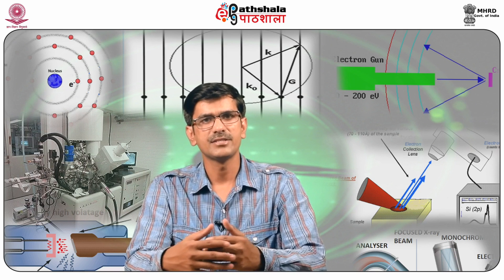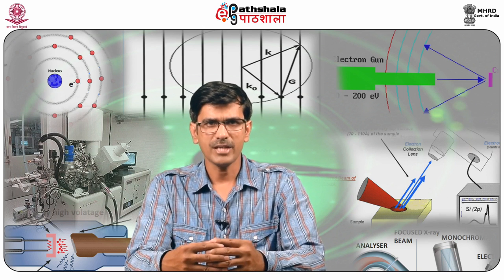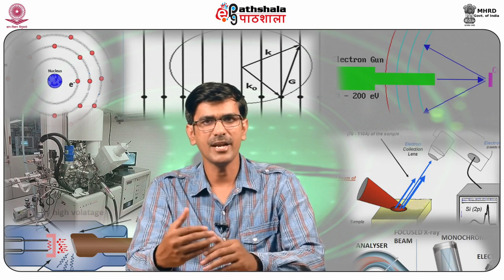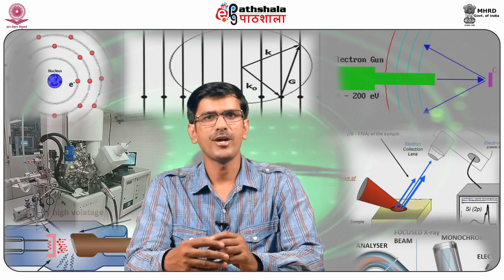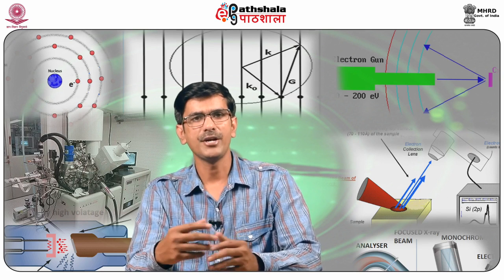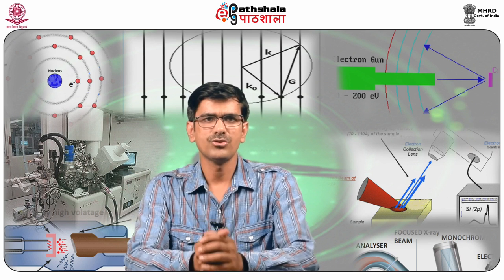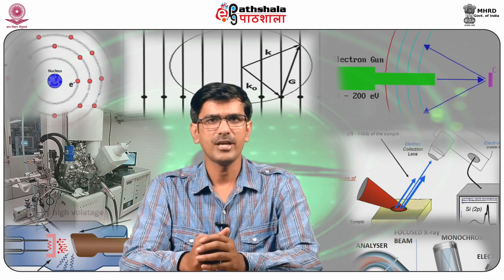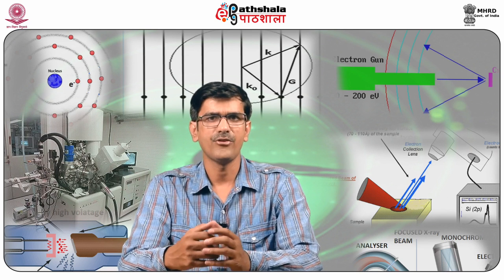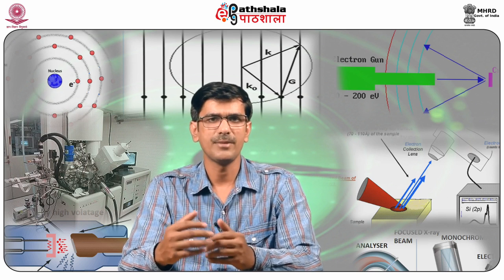Now, let's summarize all the content that we have learned today. X-ray diffraction or XRD analysis is an analytical technique designed to provide more in-depth information about crystalline compounds, including identification and quantification of crystalline phases. This is a useful tool when trying to identify a contaminant or corrosion product, and for identification of a foreign phase for purity analysis of a crystalline powder.